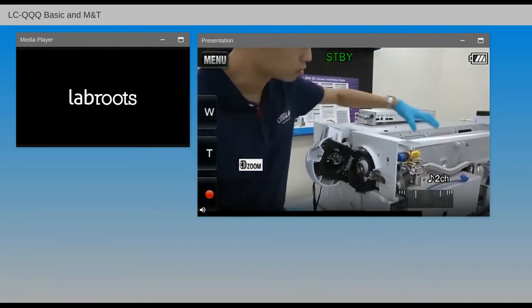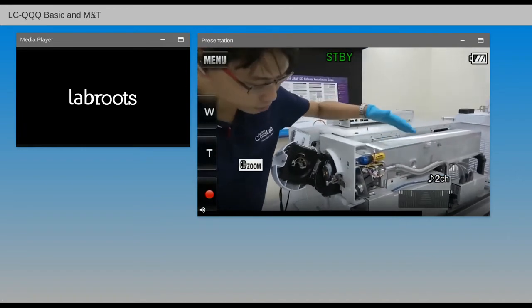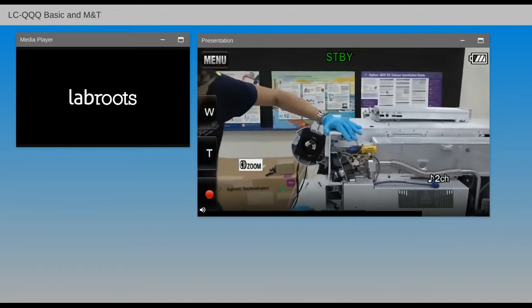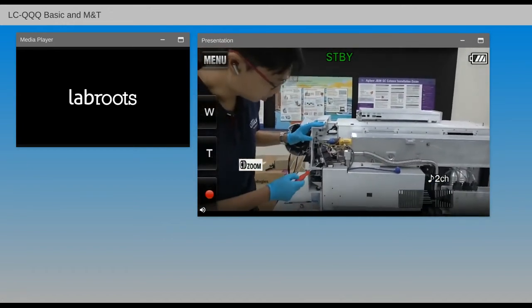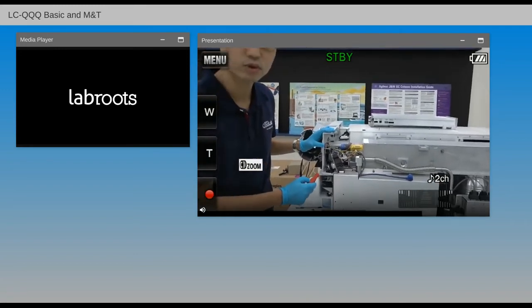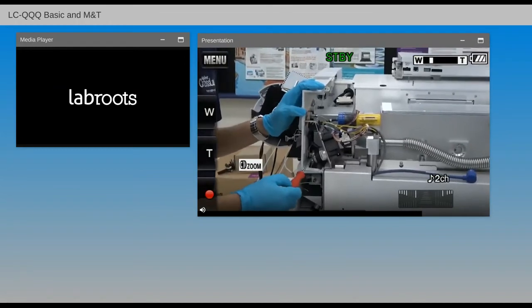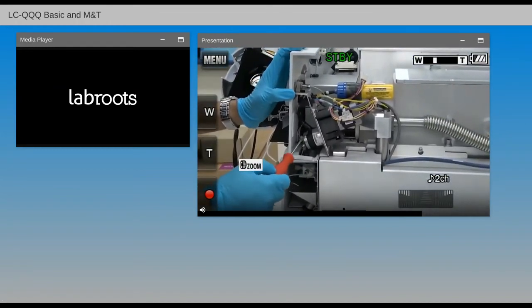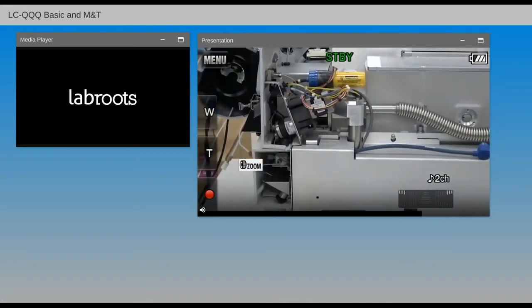So right now I'm going to walk over to show you different parts of the instrument, starting from the calibrant delivery system, where we have our tune mix in this bottle, and the valve that is diverting between the LC to mass spec or even to waste. This works through this calibrant delivery valve, drawing the tune mix.